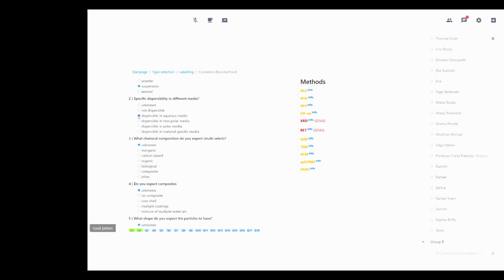We saw that. What chemical composition do I expect? Well, I know that from the ingredient list. It tells me that it contains small sized titanium dioxide particles with the label nanomaterial. And so this must be really small. But it also contains zinc oxide with no label. So these are probably larger zinc oxide particles which may be in there.